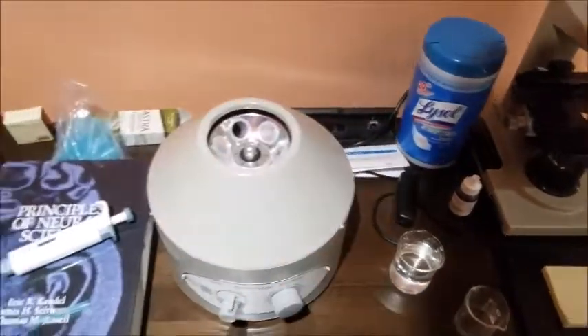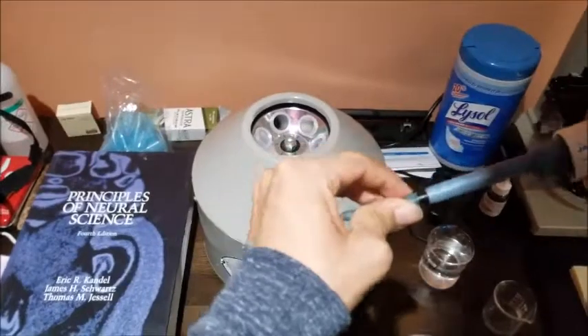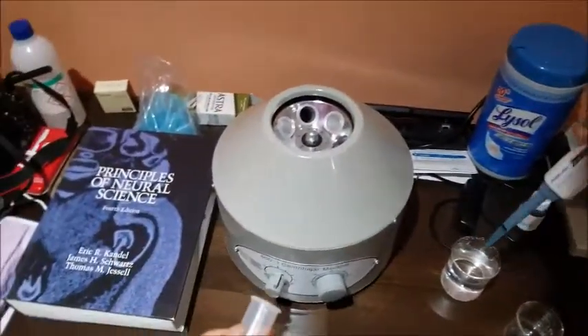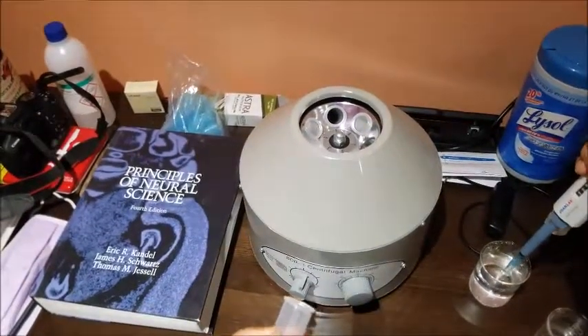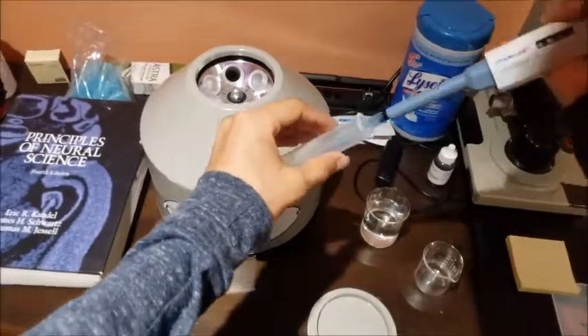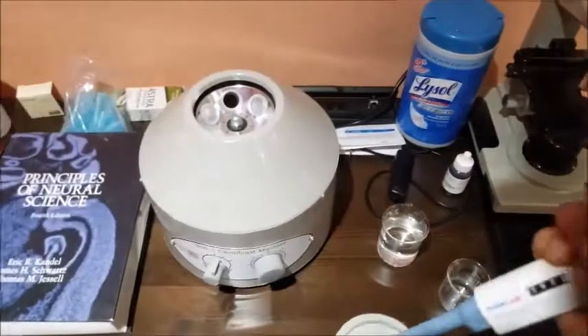Open your centrifuge lid, and then connect your pipette tip to your pipette. Pick any tube you want and draw up your desired quantity of solution — in this case it's one milliliter. Add it into your tube and then replace the tube into the centrifuge.